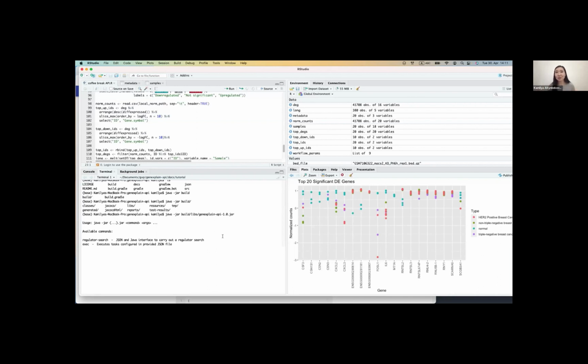But again, trying to use it on its own separately, you need to go read documentation to figure out how to work with it, when you already have a nice interface with just two main JX workflow and JX analysis, which already has a standardized way of how you access and work with these commands. You don't need to think about what the parameters of a specific third-party tool are. So you just go, it's very convenient even for an experienced user.